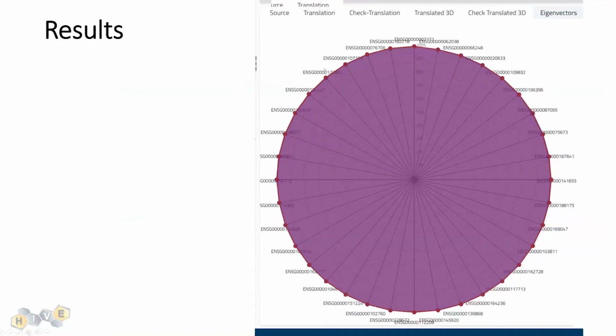And then if you see something like this, that's probably a bad sign. This is saying that it thinks that everything is 100% important, which means that it's probably just finding noise, which could be a good thing. So if you run a negative control, either a biological control or a technical control, like if you added some categories in the categorization table that made sense as a negative control for your experiment, then you might see something like this, and that might be a good thing.